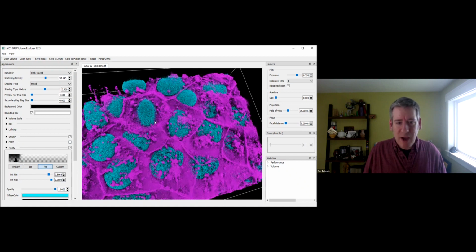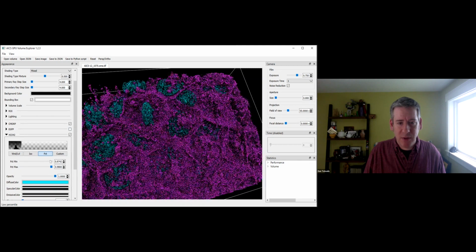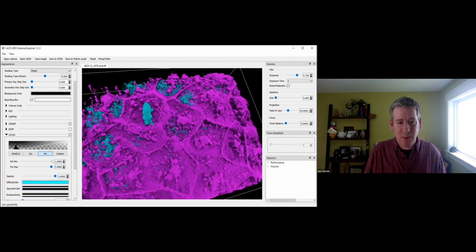So these are looking pretty round. This one is still really fuzzy, and I know that's because it has a much higher intensity, as that's our dividing cell. So if I threshold that data some more, we'll bring that into really good focus. So we're getting a sense of just how much more intense that area is than the other areas. Let me turn that back a little bit.